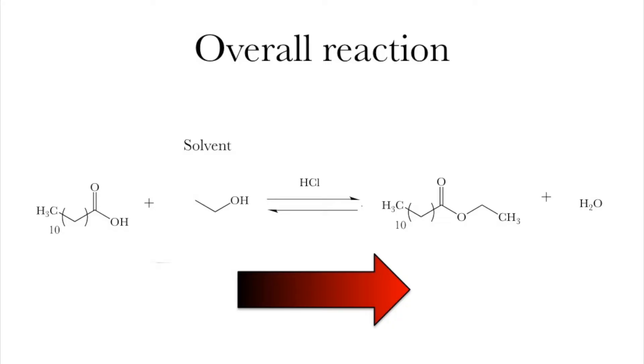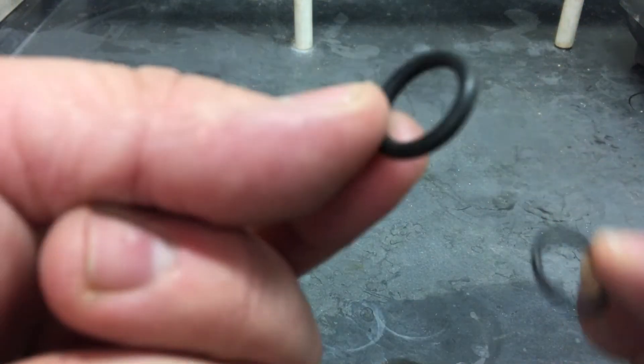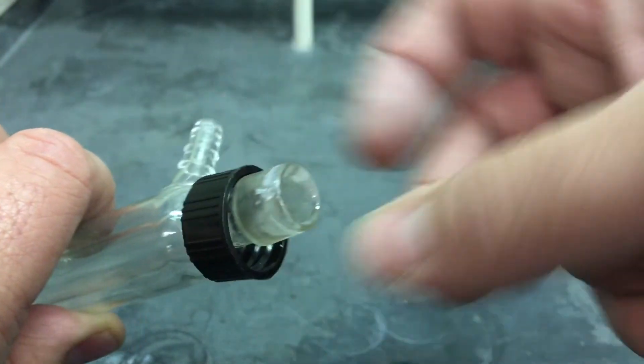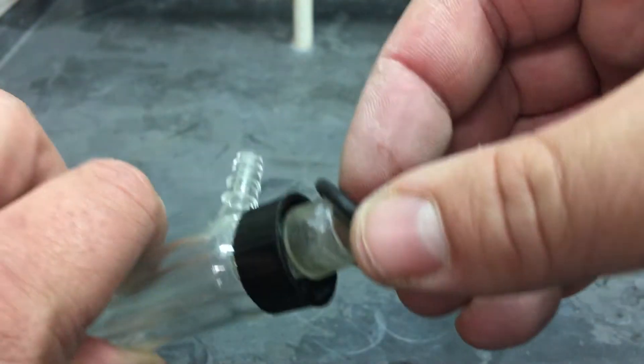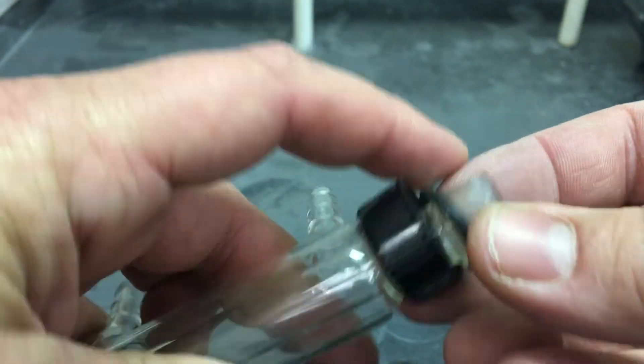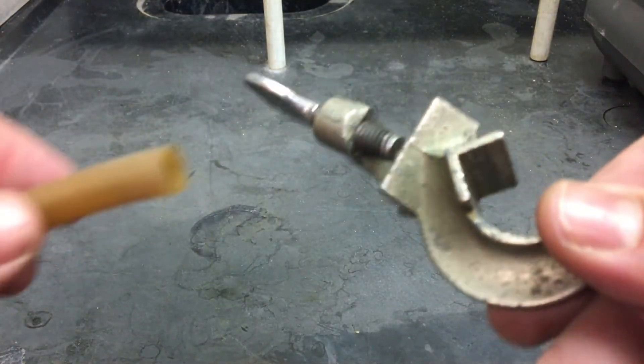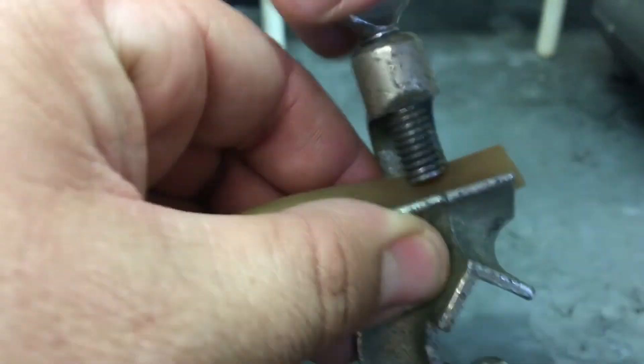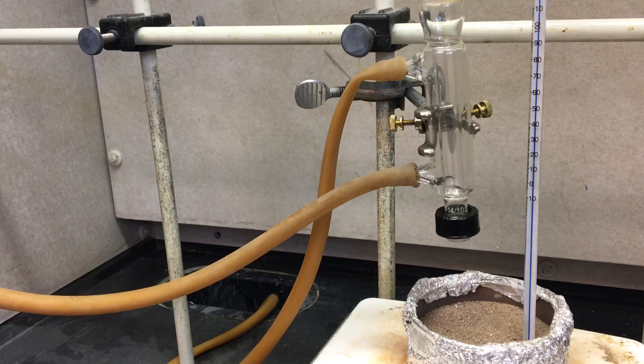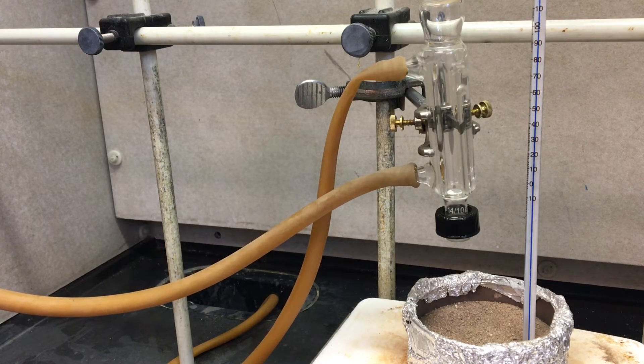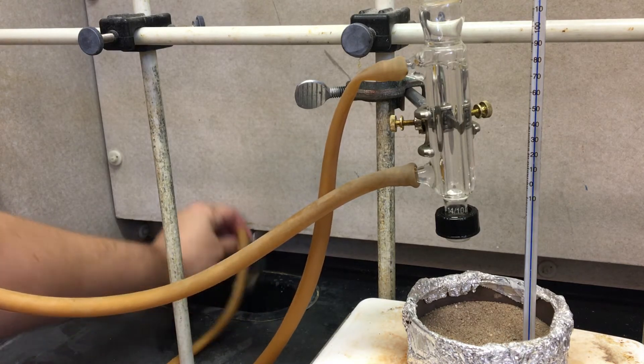When you're setting up the apparatus today, you're going to want to connect the conical vial to the water-cooled reflux condenser. For this, you'll need the thick O-ring. You want to take the water-cooled reflux condenser, add the cap with a hole, and only then place the O-ring on it. You want to make sure you get it past that little bit of glass rim right there. Once you have it on, you can connect the water in through the bottom, out through the top. Adding a clamp as a weight to the end of your out-hose will make sure that it doesn't spray everywhere. And testing your setup before you get your chemicals will make sure that if it does spray anywhere, your compound doesn't get ruined. All you need for your water flow is just a little bit of a drip.